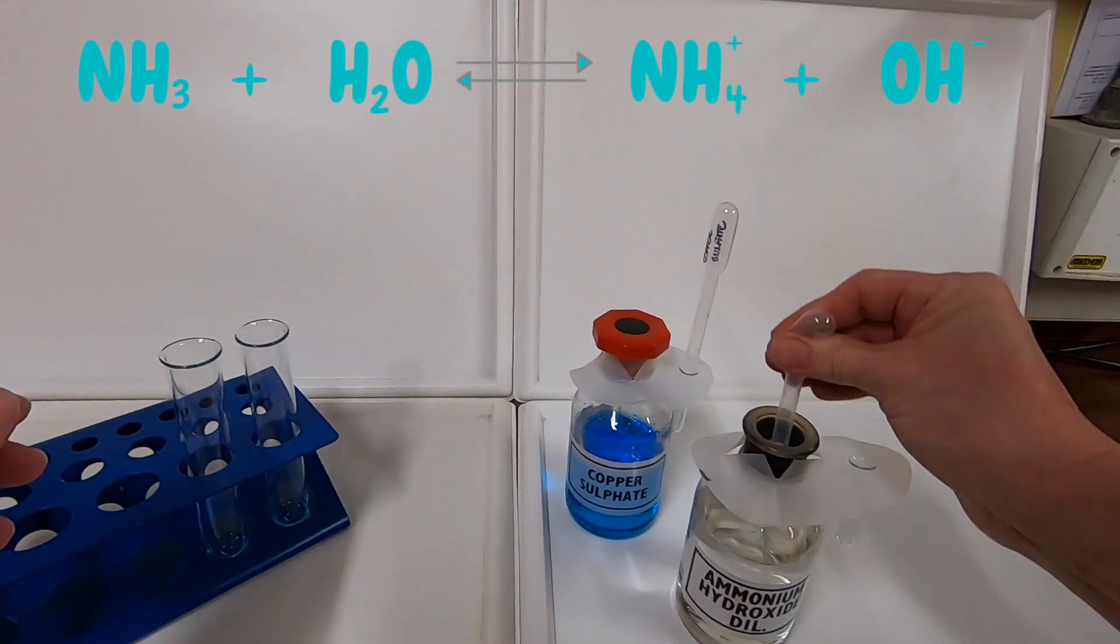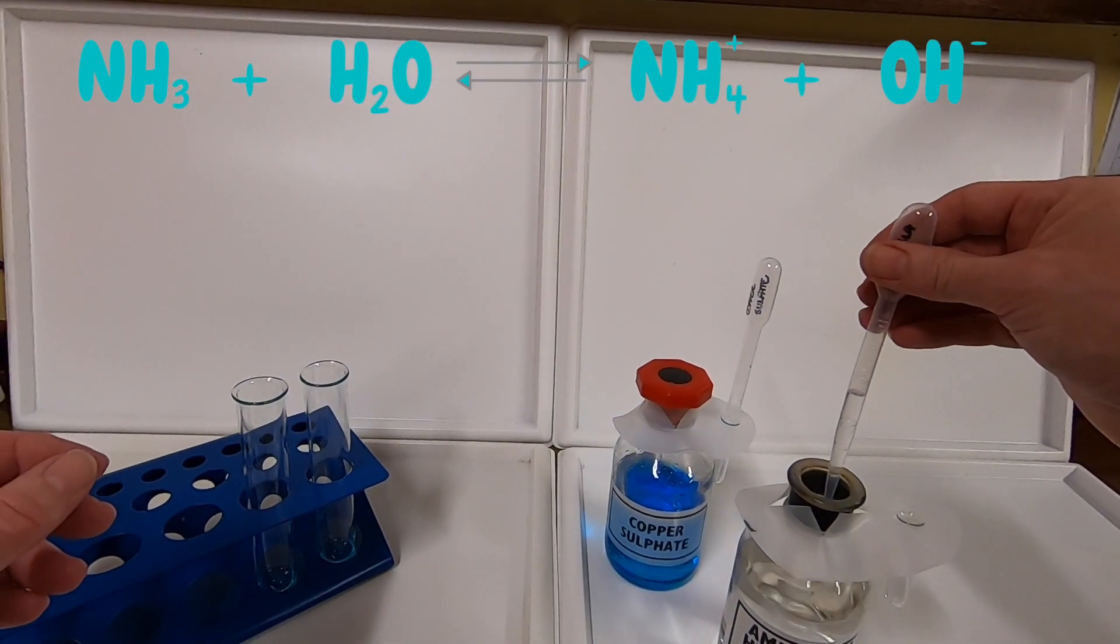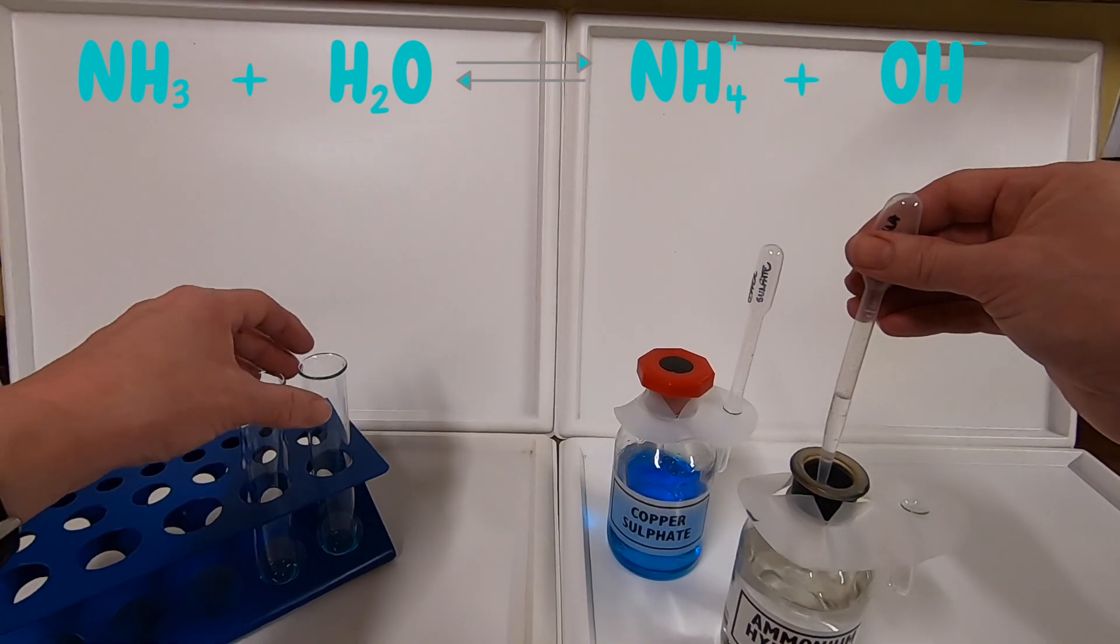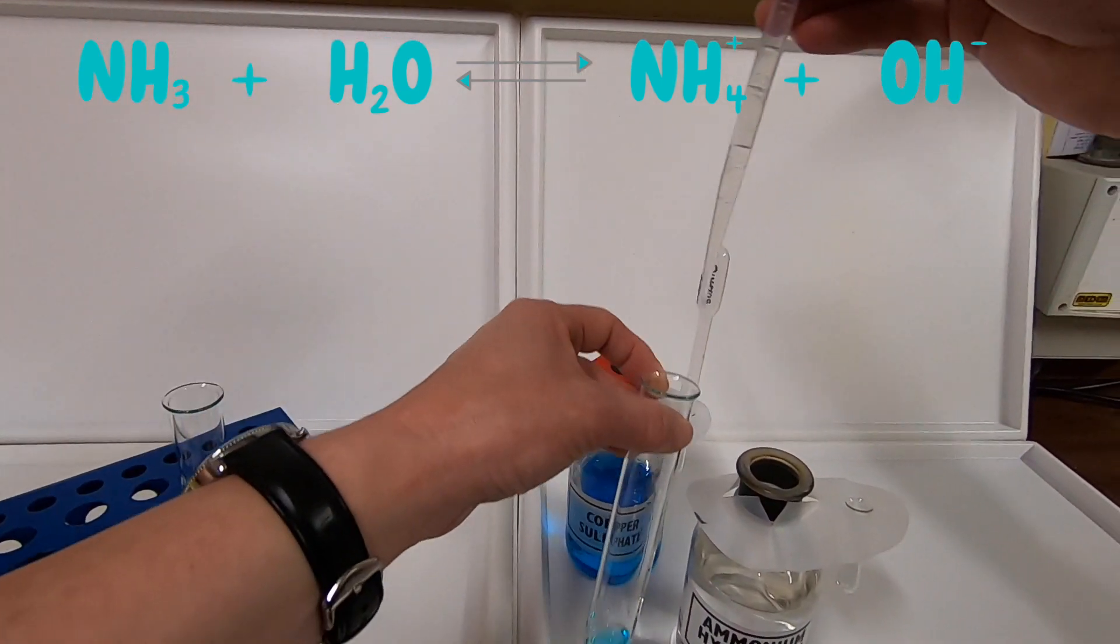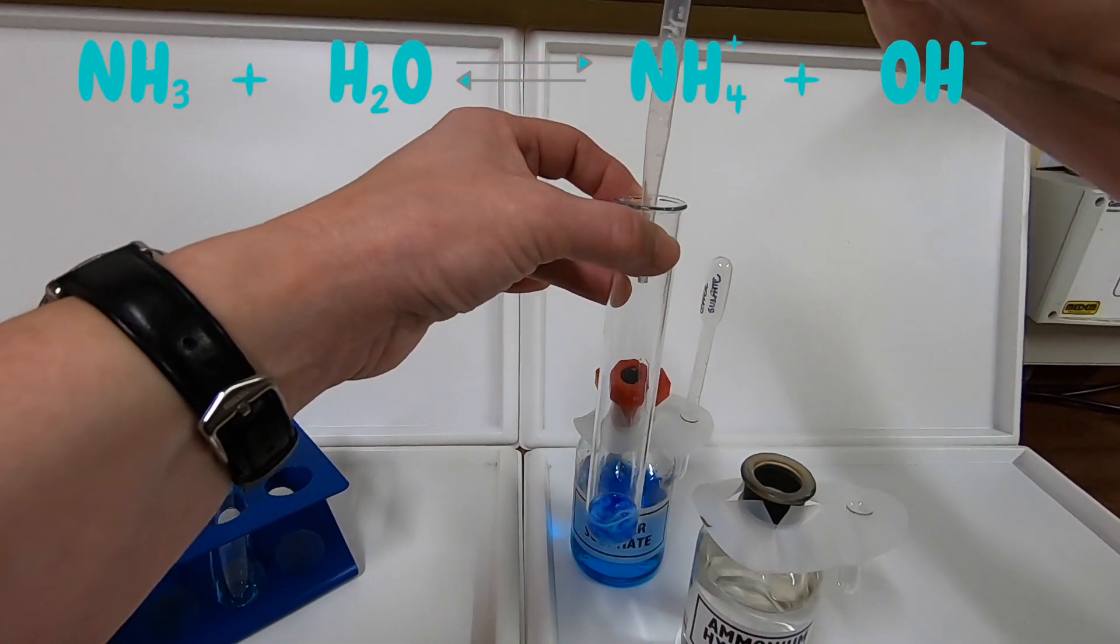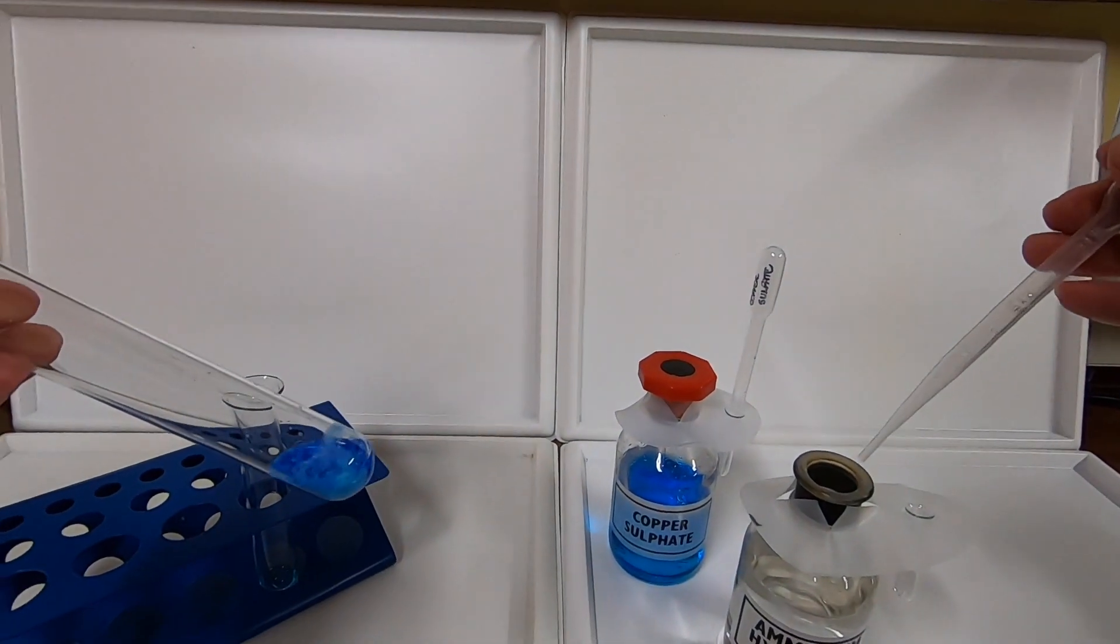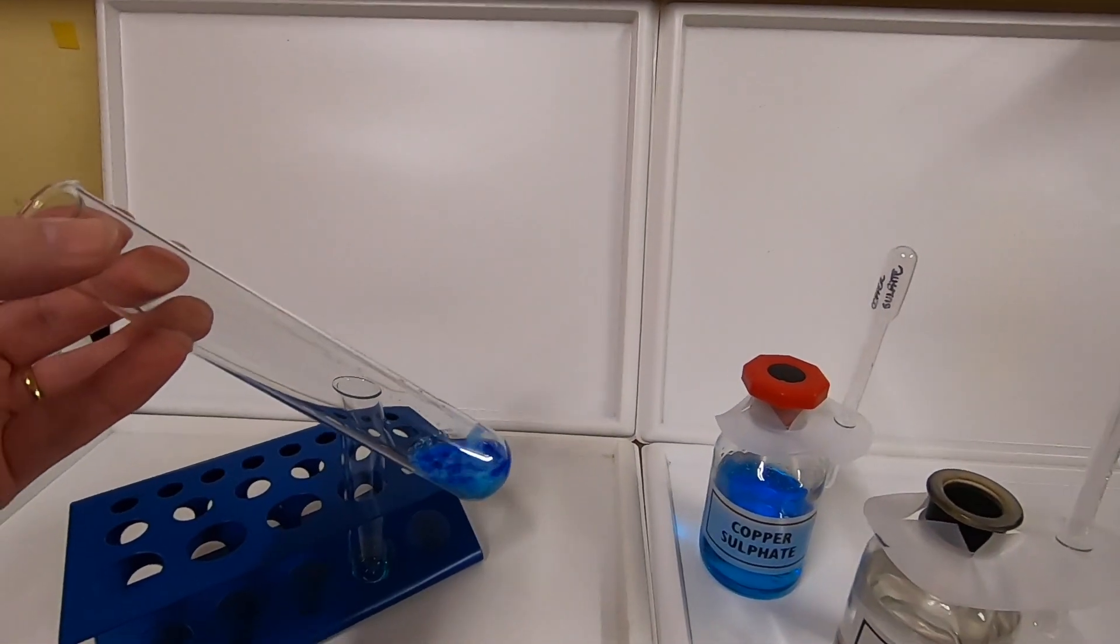When ammonia dissolves in water, it forms an equilibrium mixture. In this mixture, there are hydroxide ions. It's these hydroxide ions that are going to replace the aqua ligands in hexa aqua copper two ions.